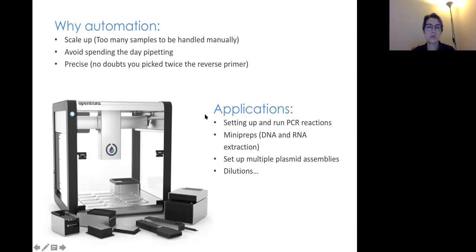Like here, today I'm going to talk about setting up a PCR reaction. And I thought there were mainly biologists here. So if there's someone, I don't have a slide explaining the PCR reaction, how it works, my fault. But it's just to amplify the DNA.